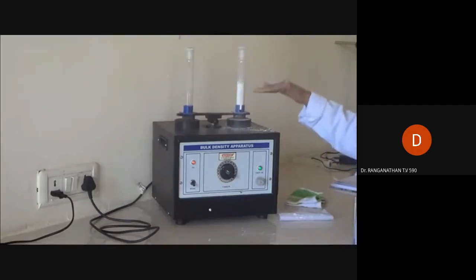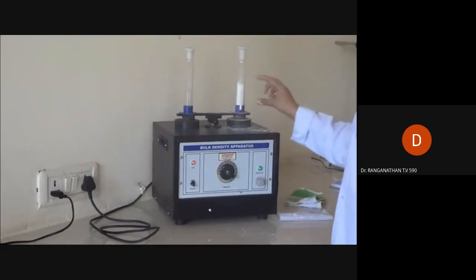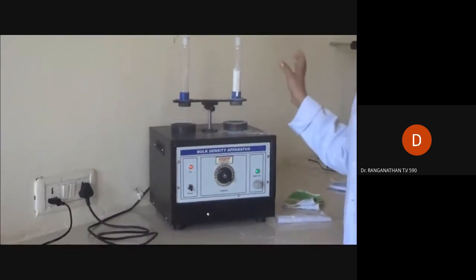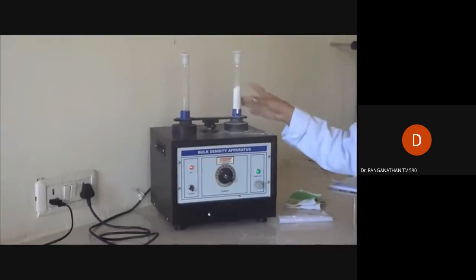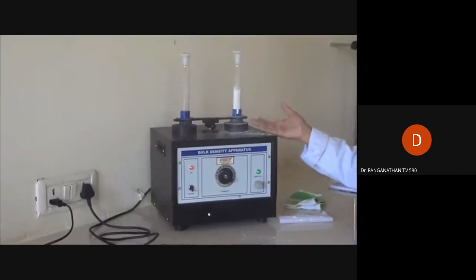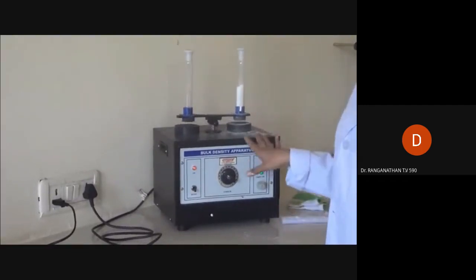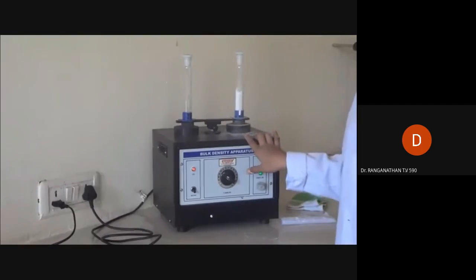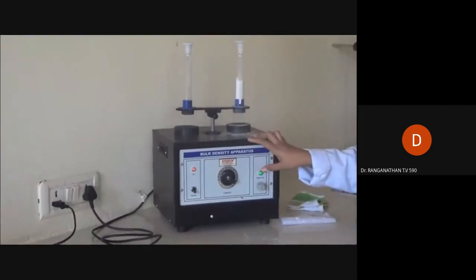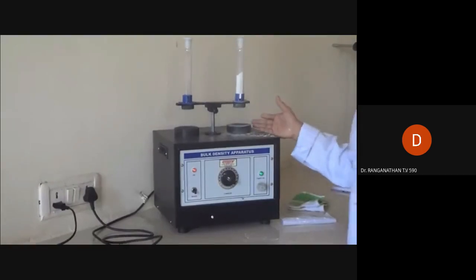This tapping continues, the powder will settle and the volume will decrease. Tap volume is always less than bulk volume. So, by calculating this tap volume, we will transfer this value into the tap density formula, that is mass upon tap volume, and from that we will calculate the tap density. So from this method we can determine bulk and tap density of different powders and for production of tablets.